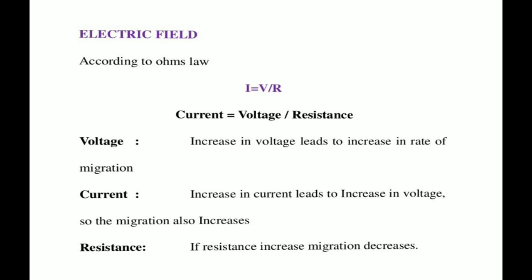Okay, so however, voltage that is too high can possibly melt the gel or cause smearing distortion of the DNA bands. जर तुम्ही व्होल्टेज खूपच जास्ती वाढवलं तर काय होणार आहे, ते जेल जे असतं supporting medium म्हणून वापरता तुम्ही, ते मेल्ट होऊ शकतं आणि that causes smearing distortion आणि मग तुम्हाला जे काही बँड्स येणार आहे DNAचे ते व्यवस्थित दिसणार नाही. ठीक आहे, so if the separation of electrodes is d, suppose, in meters, and the potential difference between them is V in volts, then the potential gradient is V by d volts per meter.